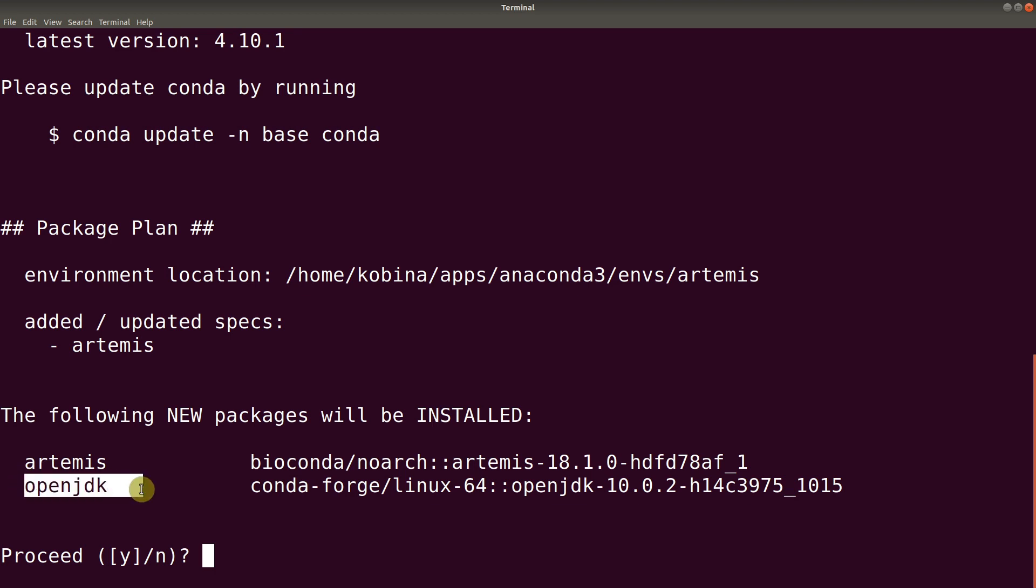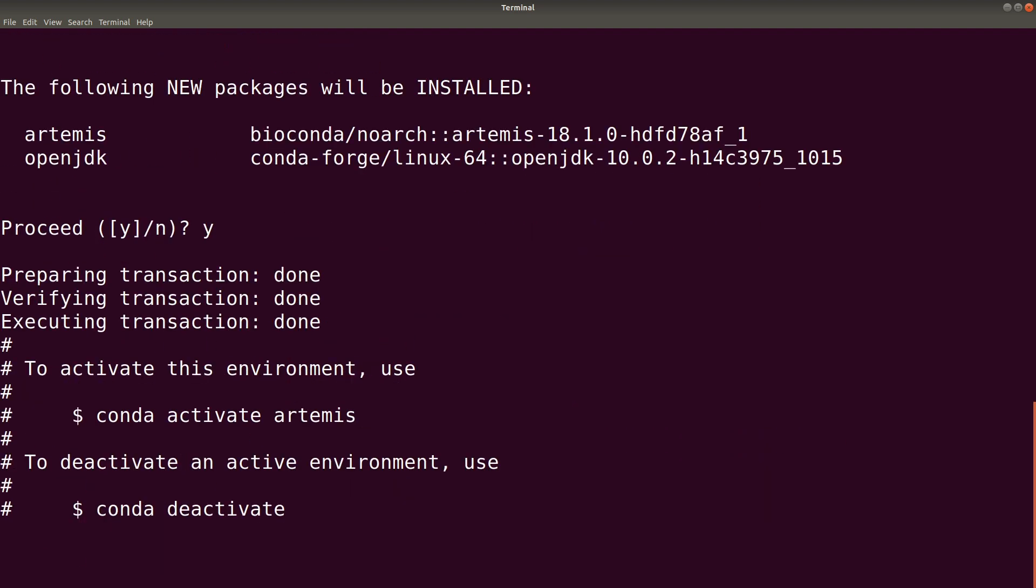Artemis needs Java to run. So Conda also installs that automatically for you. So let's hit the Y to confirm the installation. Then we hit Enter. So now it quickly installs everything for you as well.